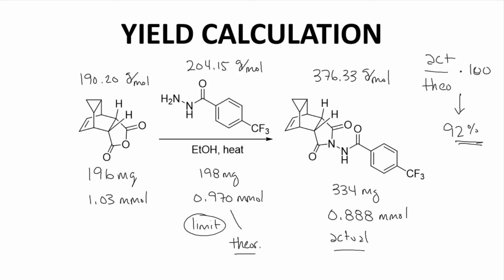Finally, I want to be very clear that this video does not describe a synthesis of TPOXX. TPOXX is a drug product that includes not only tecovirimat, but also formulation ingredients, excipients, to ensure stability and safe, effective delivery of tecovirimat to patients.